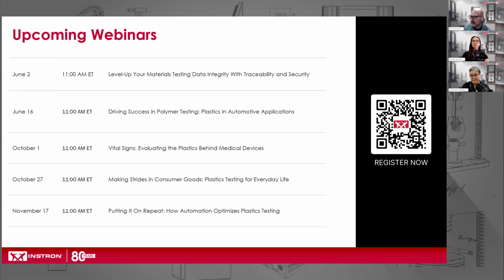Okay. I'm seeing one more question, and then we'll see if any others come in. At what point does it make sense to add specialized equipment like fatigue or impact testers versus using a universal testing system? I say you look at what the standard is telling you to use. As we noted, for Charpy and ISO standards, to be in full compliance you need to use a pendulum.